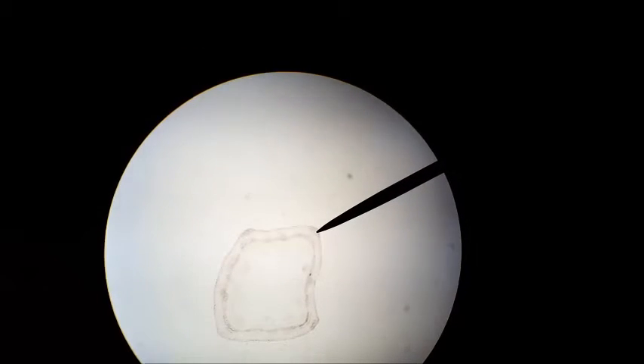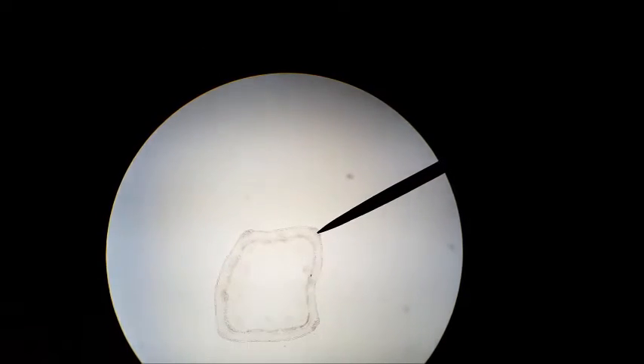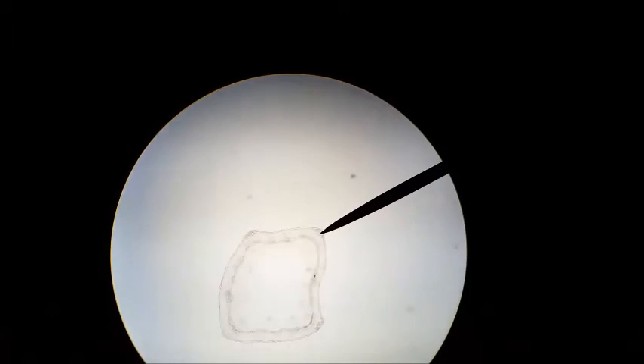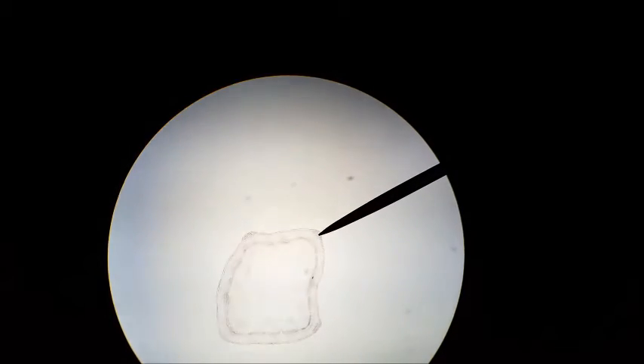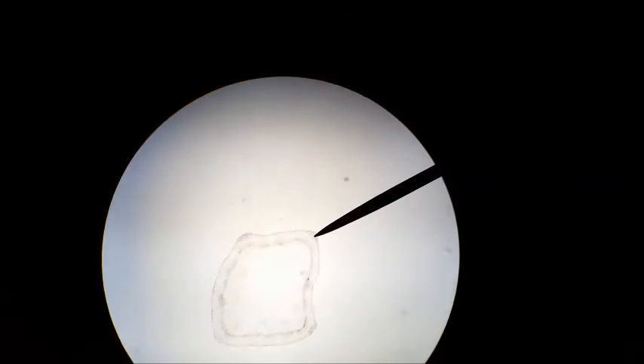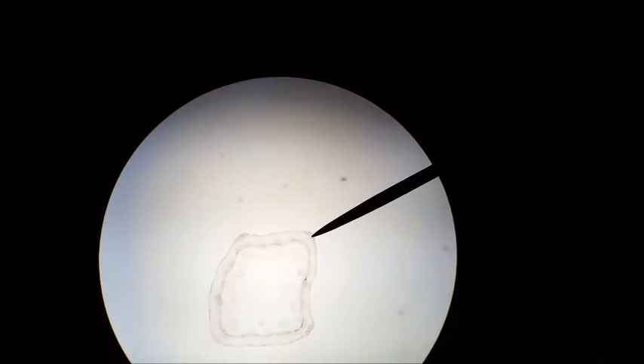In this 40x magnification of the alfalfa dicot stem, I have the pointer on the reinforced corner, which is most likely colenchyma — not chlorenchyma. Colenchyma is for support, whereas chlorenchyma is parenchyma that has chloroplasts in it.